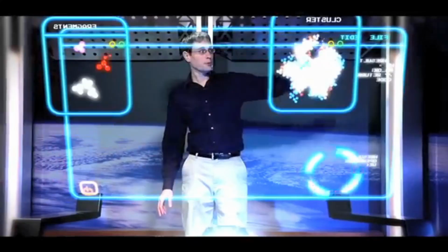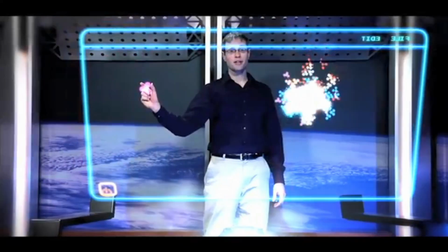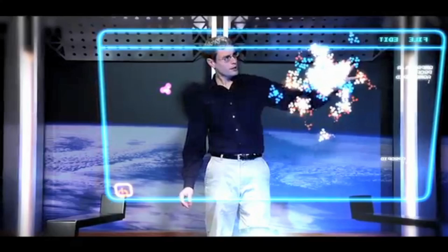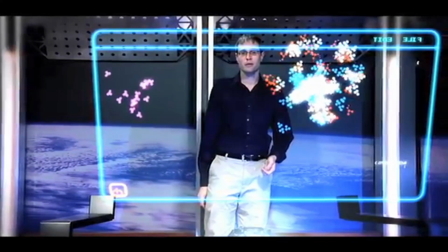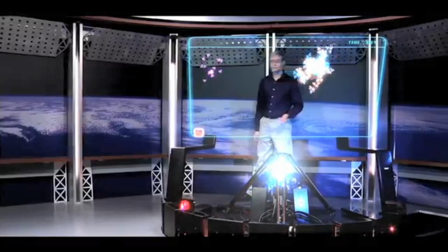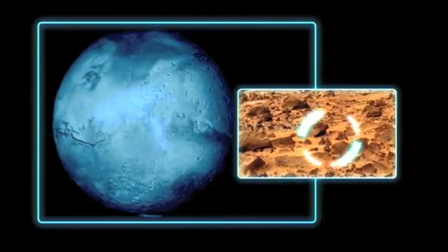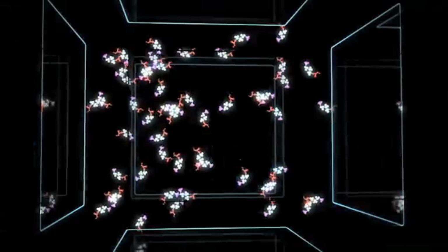What happens if you have something like this, and you want to find out if something like this is inside? Obviously you can't tell just by looking at it, but if you separate things out, the answer becomes clear. Scientists have the same problem. How do you know if there was once water on Mars? Or, for that matter, life? Obviously, you can't tell just by looking at pictures of Mars, but scientists think the answer may lie hidden in tiny molecules in Martian soil.